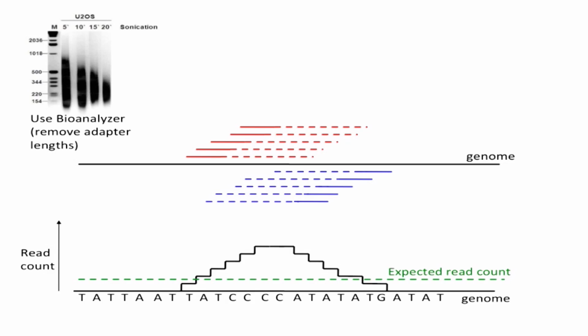What's the expected read count in a given experiment? How many reads would you expect? Yeah, whatever you got in the IgG control. You could use that. Let's say that for now you don't want to use that, because you have different read number sizes. Let's just calculate what's the expected read count in a given experiment.